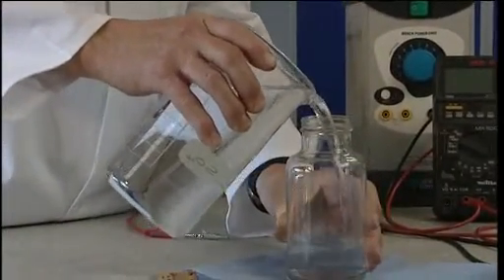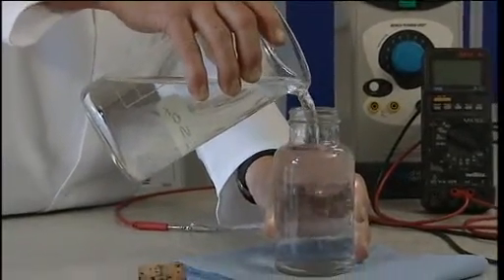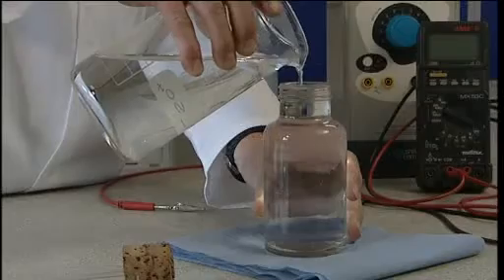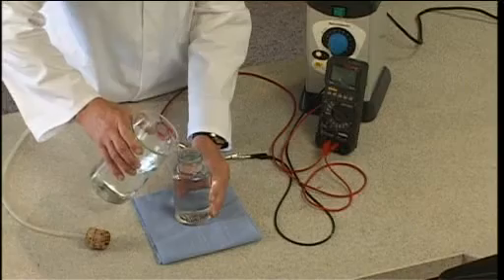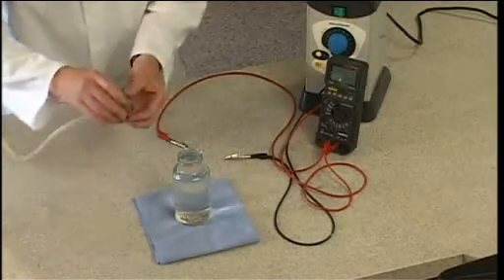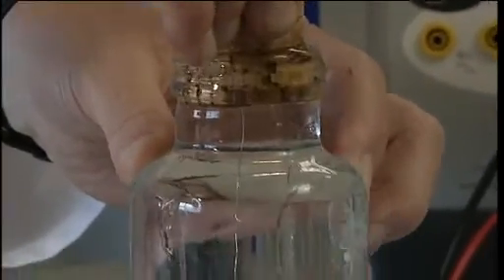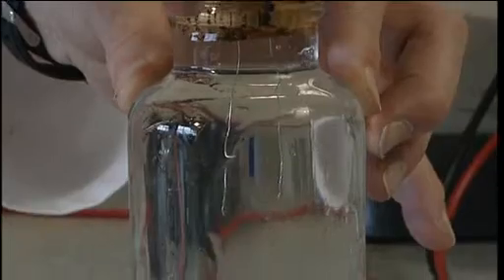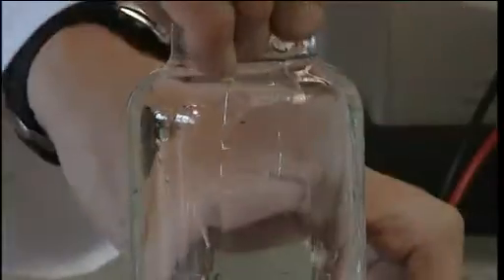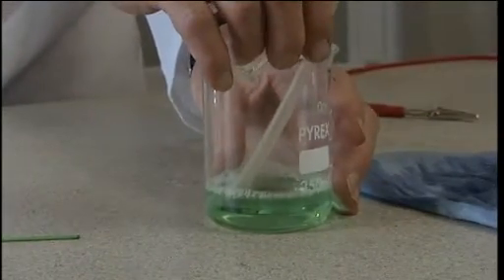We fill the jar to the very top so there is no airspace at all, and fit the electrode assembly. Inevitably, a little bit of the solution will escape. We place the delivery tube in a beaker of water to which a little bit of washing up liquid has been added.